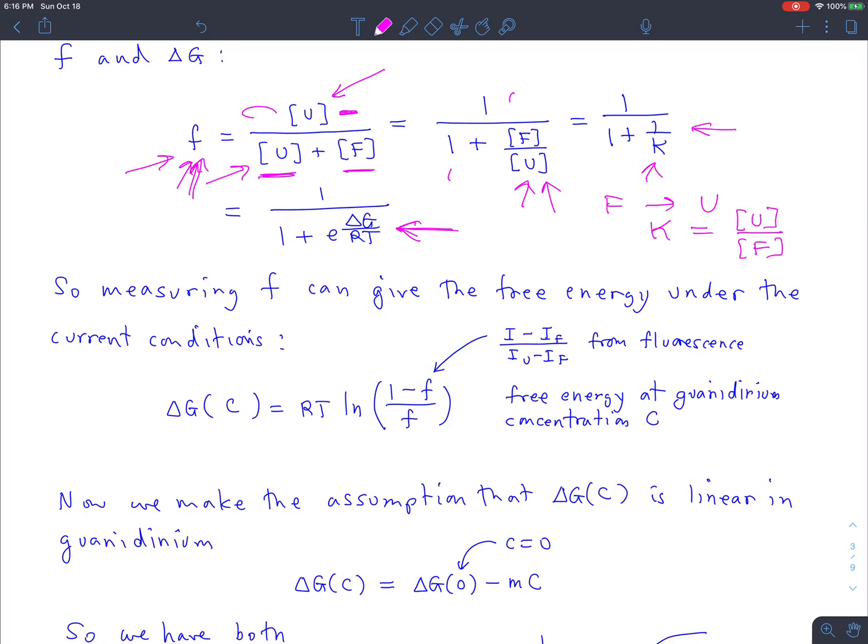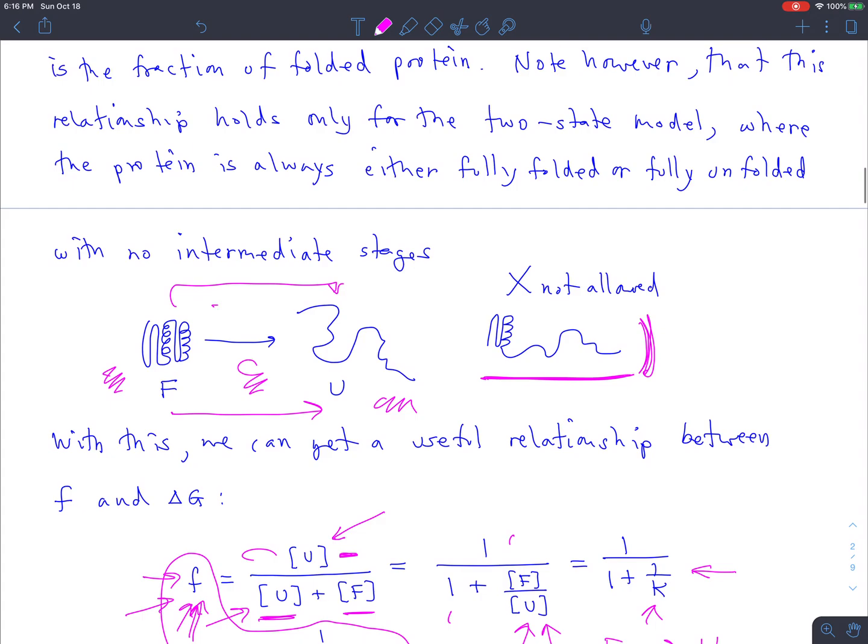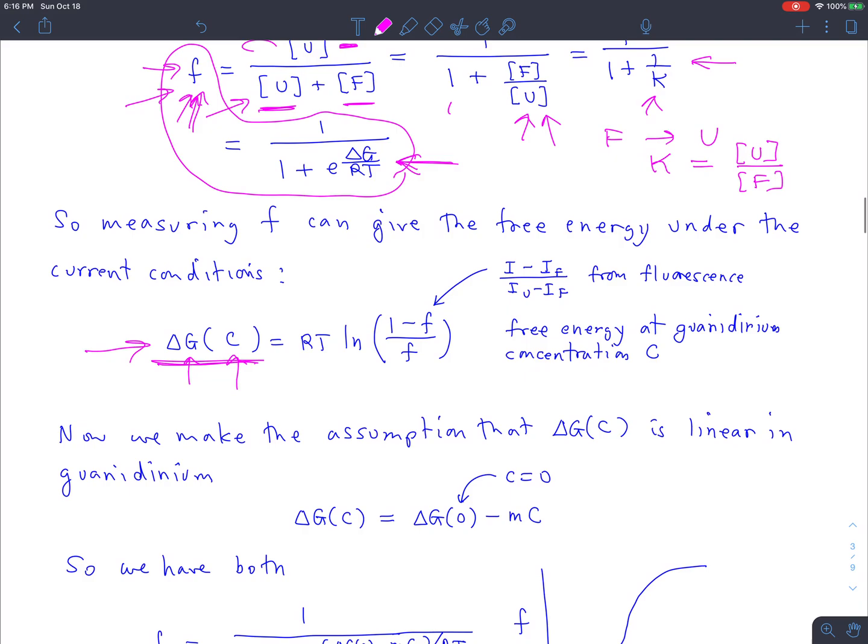All right, solving for delta G. So we can solve this relationship for delta G. If you do that, you get this, that the delta G at each and every concentration, right? This fraction will vary as we change the concentration, and therefore we'll get a different delta G at each concentration, because after all, the free energy of unfolding depends on what that concentration is. If the concentration's high, the free energy of unfolding is a lot more favorable than if the concentration's low. So this delta G should depend on the concentration, and we'll get that at every value of the concentration that we use by just plugging in this measured number we get from our fluorimeter, right? This is the experimentally measurable quantity.